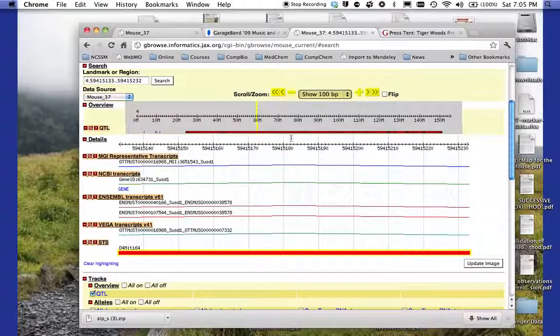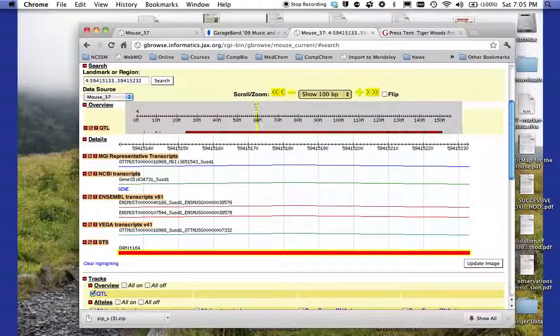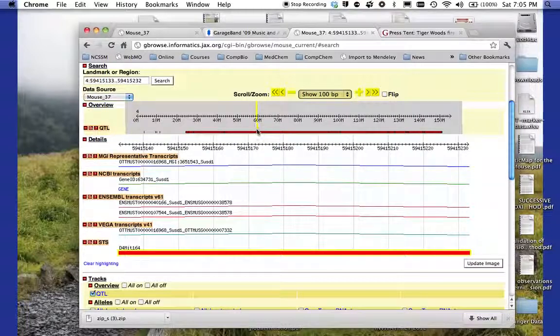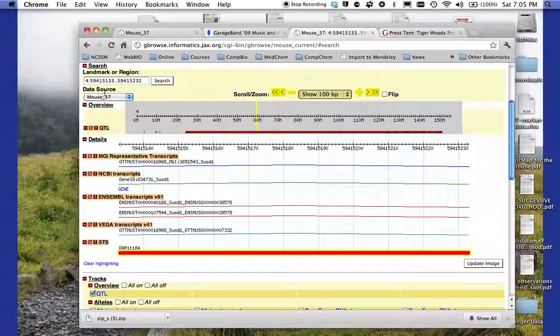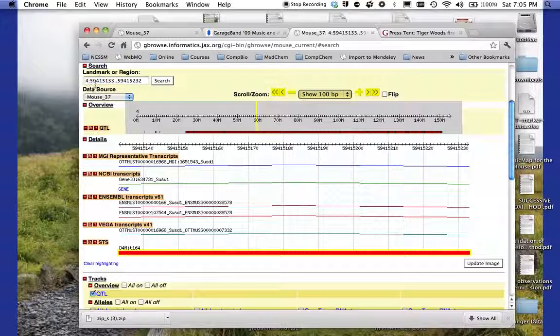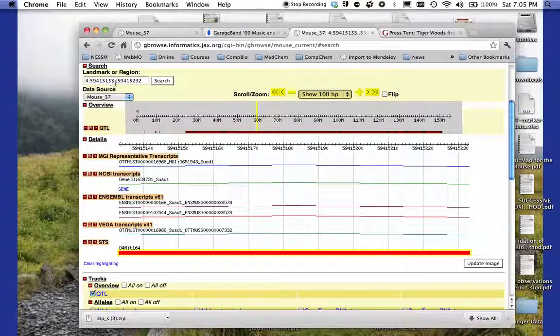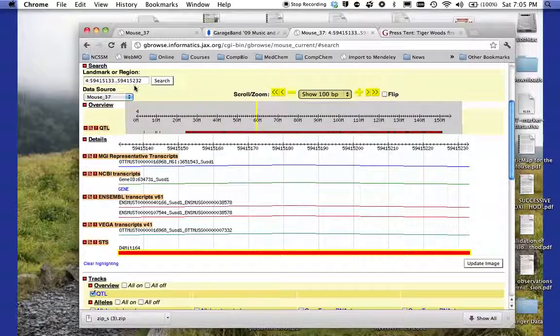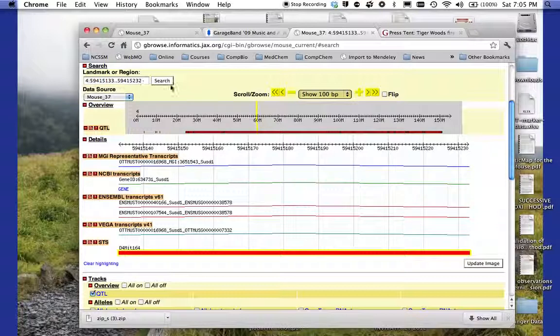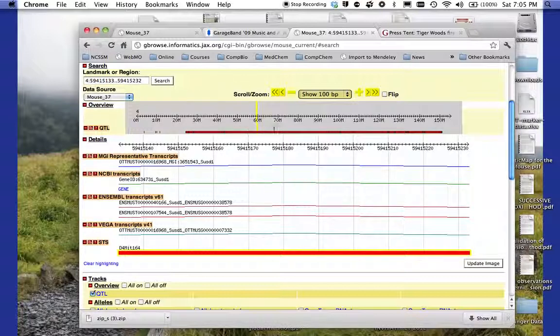And what I'm noticing in here. So here's my marker right here in the yellow. And it's telling me that that marker is about, in terms of base pairs, 59415133 to 59415232. So it shows me what I'm looking at here in terms of region.